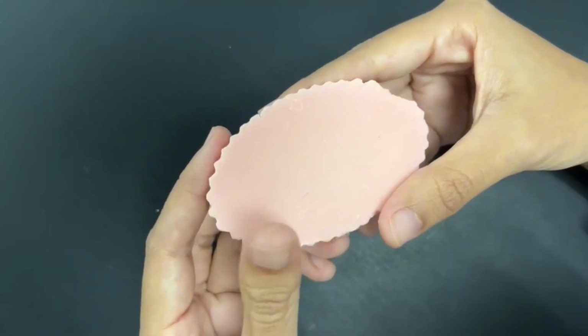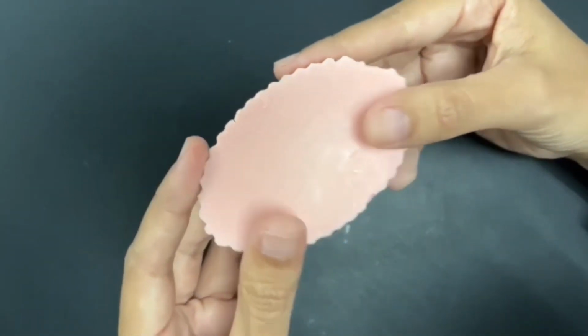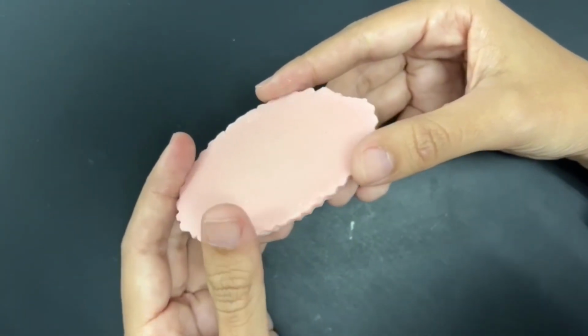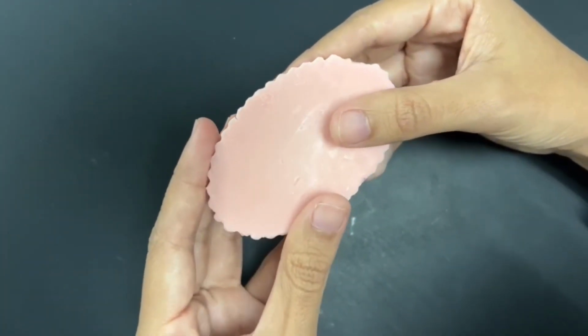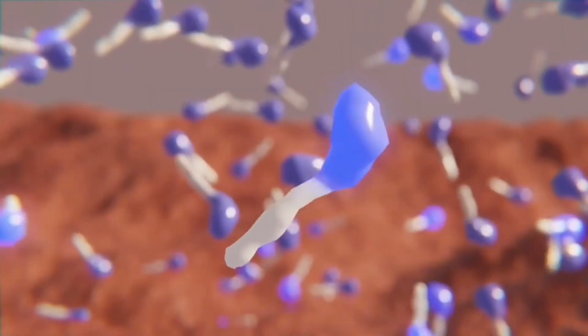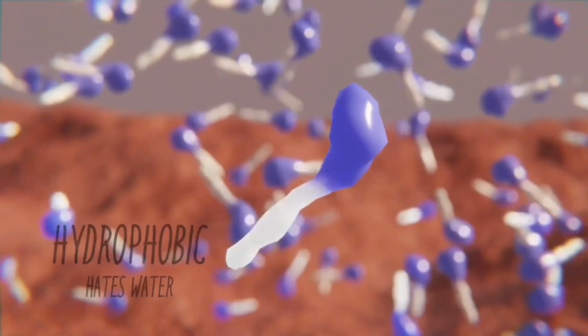During this stage, saponification initiates. Sodium hydroxide breaks down the fats and oil into individual fatty acids and glycerol. The fatty acids combine with the sodium ion from the sodium hydroxide to form soap molecules. These soap molecules are hydrophilic on one end and hydrophobic on the other.